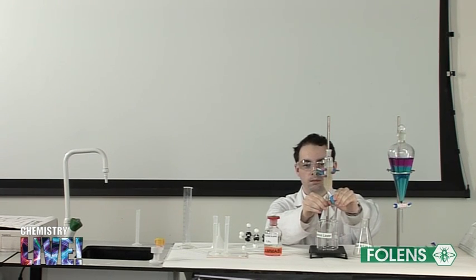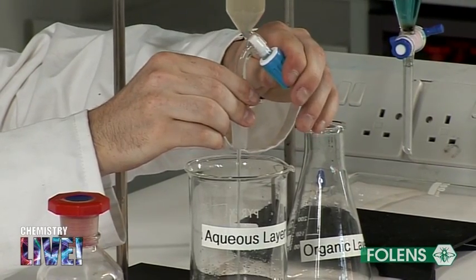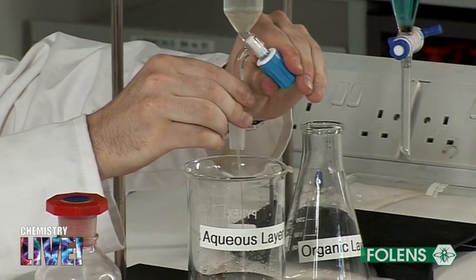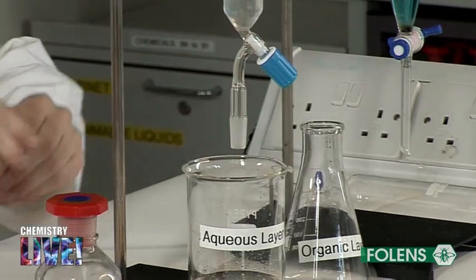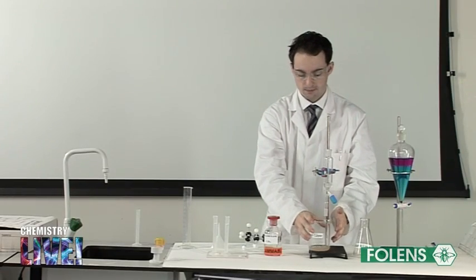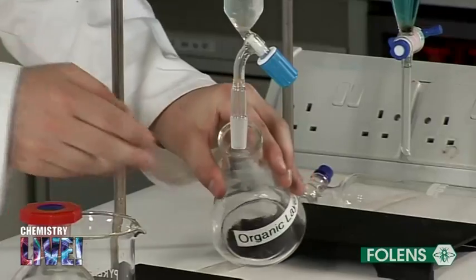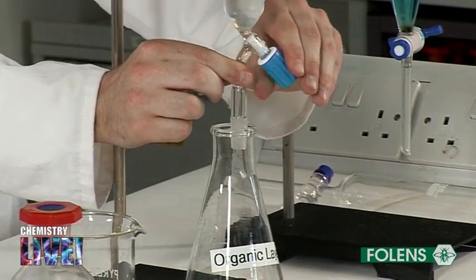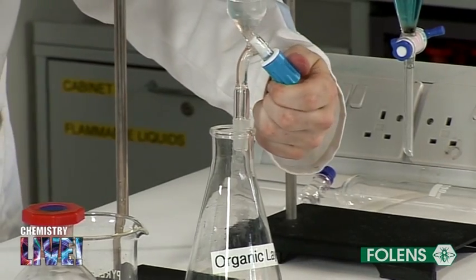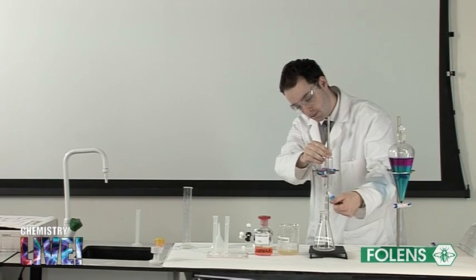Allow the bottom aqueous layer to flow into a beaker marked aqueous layer. Close the tap as soon as the organic layer comes close to the tap. Place a clean, dry conical flask marked organic layer under the separating funnel. Open the top of the separating funnel and allow the organic layer to flow into the conical flask. This organic layer contains some of the oil of cloves that have been extracted in the first washing.